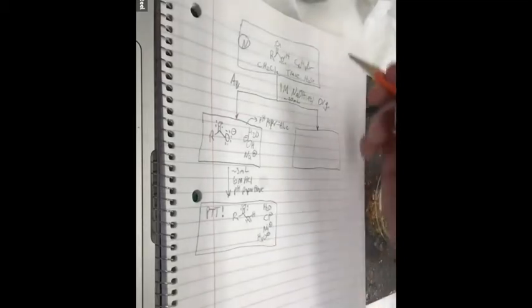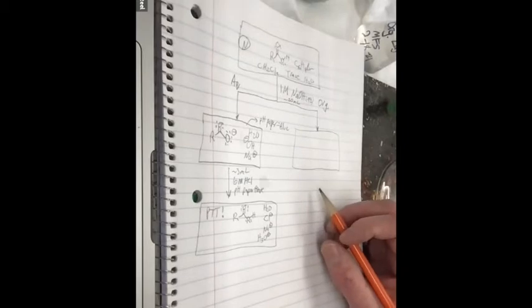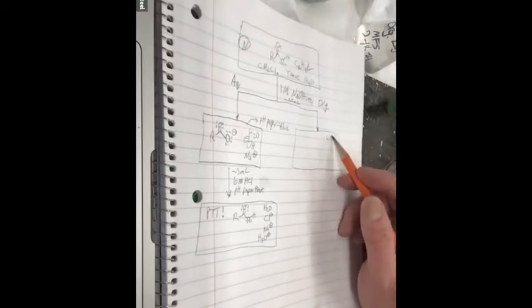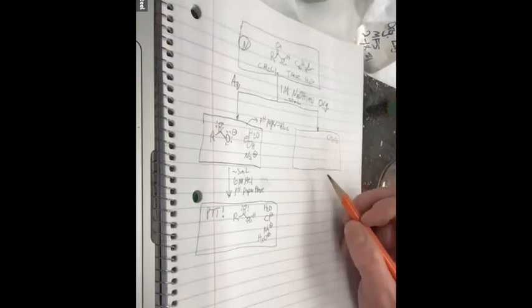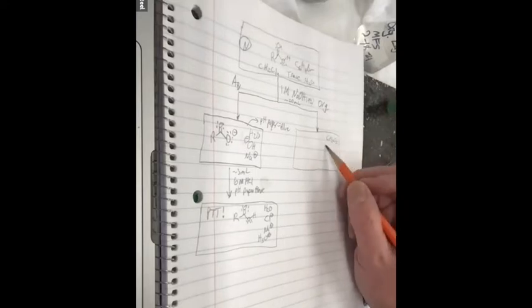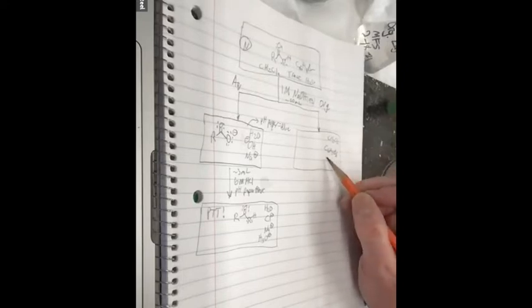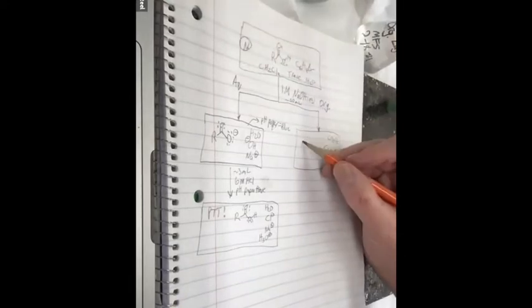That's great. So what happened on this side? What's on our second organic layer after the basic wash and the acidic one? What's mostly in this organic layer? Your CH2Cl2. Yep, methylene chloride. And what else? You'll have your dibromobenzene. And you'll still have some trace H2O. And your mystery compound. The neutral mystery compound. Yes. There we go.